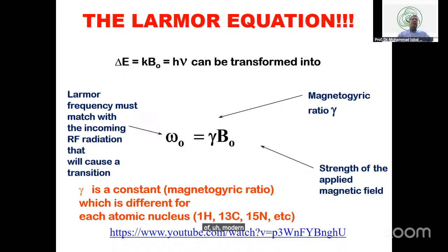The key advantage of modern physics was that people were able to develop stronger and stronger magnets. And I told you that now 1.3 or 1.2 gigahertz, 1200 megahertz machines are available. When I say 1200 megahertz, this is the frequency of proton.